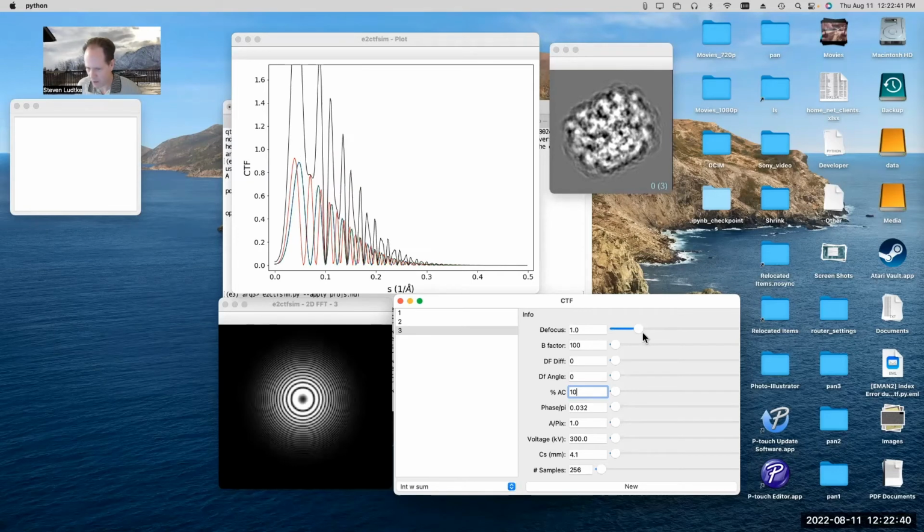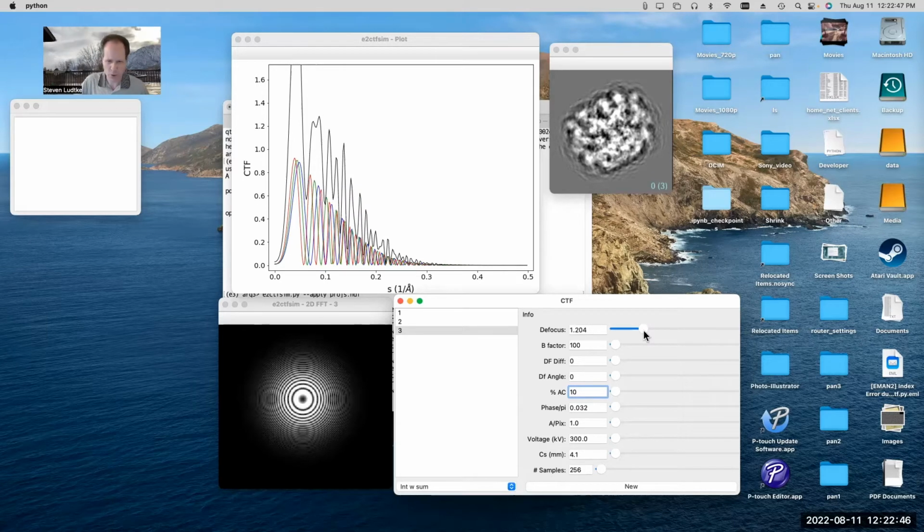So I guess what I'm saying here is we probably want to pick our defocuses across a range between 1 and 2, or 1 and 1.8 or something like that. If we continuously cover that range, we can make a pretty smooth black curve. So in our final average structure, every place where you see a little dip here would correspond to a place where you might see a little bit of a dip in your FSC curve when you get your final structure out, because you've got more information in aggregate across all the images here than you do here.